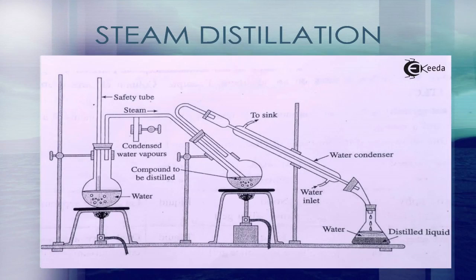Next is steam distillation. Like vacuum distillation, steam distillation is a method for distilling compounds which are heat sensitive. The temperature of the steam is easier to control than the surface of a heating element and allows a high rate of heat transfer without heating at a very high temperature. The process involves bubbling steam through a heated mixture of the raw material. By Raoult's law, some of the target compound will vaporize. The vapor mixture is cooled and condensed, usually yielding a layer of oil and a layer of water.